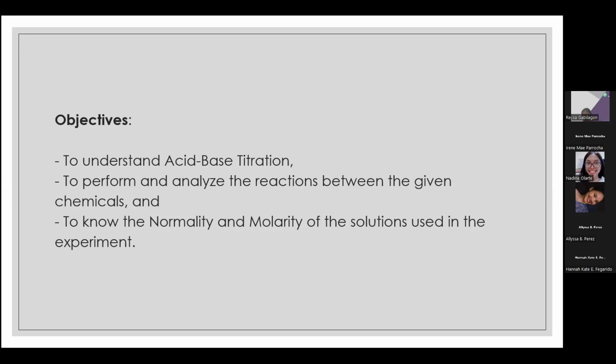Objectives. First is to understand acid-base titration. Second is to perform and analyze the reactions of the given chemicals. And lastly is to know the normality and molarity of the solution used in the experiment.